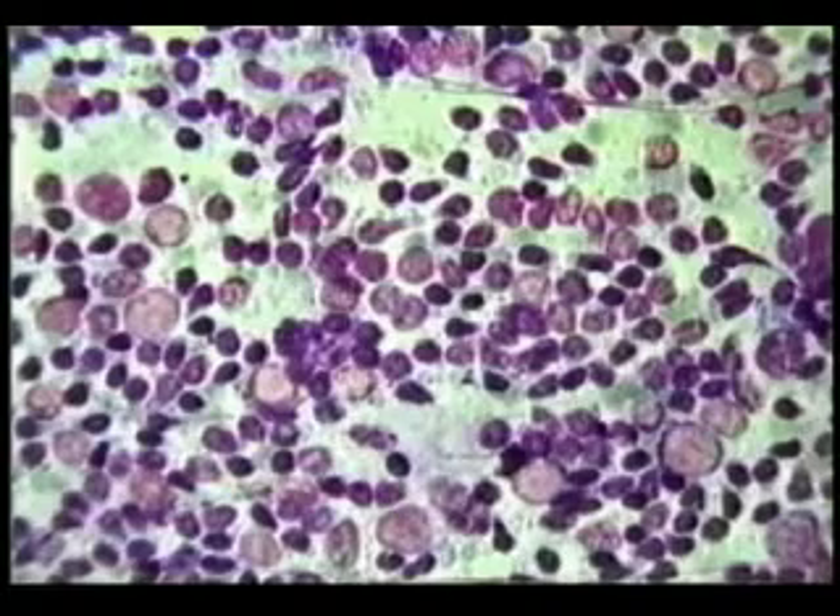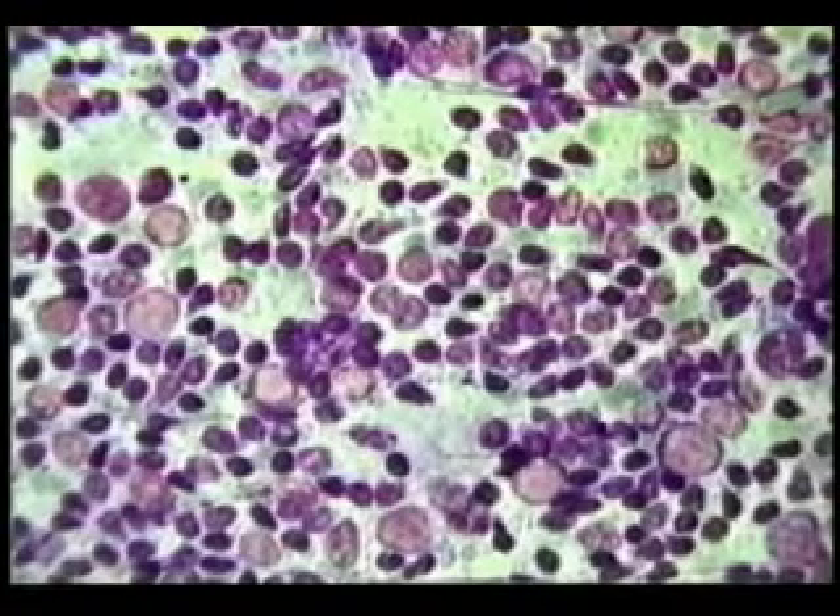After staining, the microscopic appearance is that of well-preserved cells, including cytoplasm on most cells and presence of both clusters and single cells from most lesions. A common problem is the use of too much pressure during smearing.